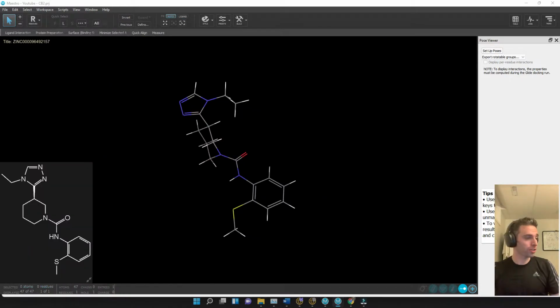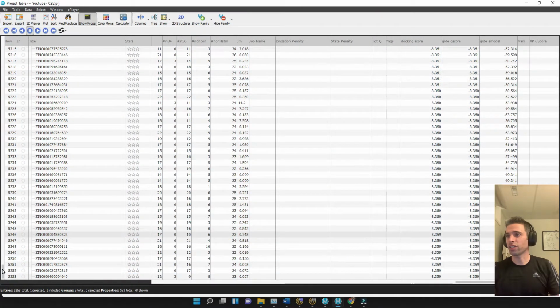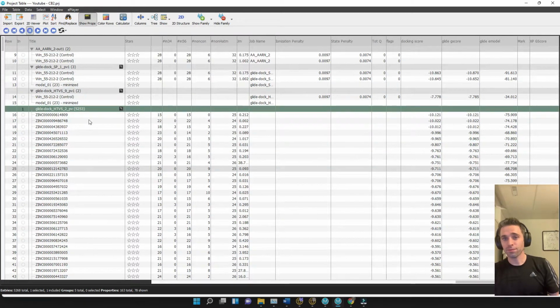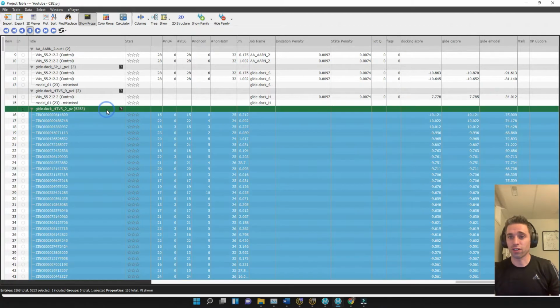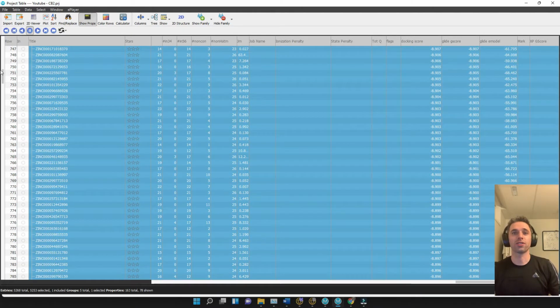I'm going to pull this back, and now what we want to do is just display the ligands. I'll do this all over here so you guys can see what I'm doing. Okay, so from our HTVS, we're going to select all of our compounds. That's all in one group, so that'll be the most efficient way to do this.